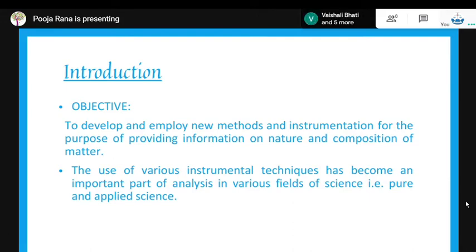So moving forward, with these advanced techniques, quality and precision requirements can be met efficiently, and this is an important step in the official recognition of quality of the laboratory also. So how well the laboratory gives the result with minimal consumption of evidence, as well as giving an extensive report of that particular evidence.